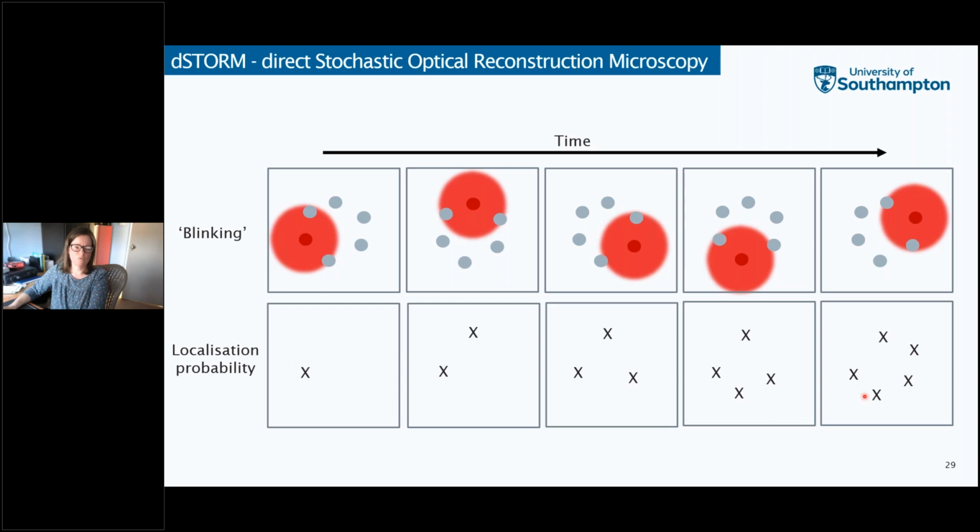And the precision with which we can determine the localization, i.e. how accurate we are, is dependent on a number of factors, including the point spread function of the microscope, the number of photons collected, the pixel size, and the background. But typically this can get down to about 20 nanometers or less, i.e. the molecule is within 10 to 20 nanometers of where we say it is.